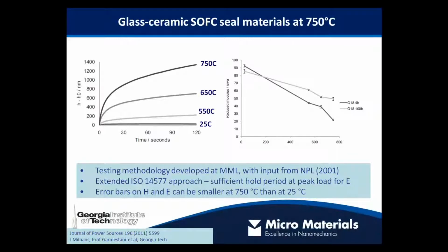So characterizing their long-term deformation with respect to temperature is important. There are two samples in this study. One of them has been aged at 800 C for 4 hours, and another one aged at 800 C for 100 hours. The objective being to try to stabilize the material against ongoing plastic deformation.